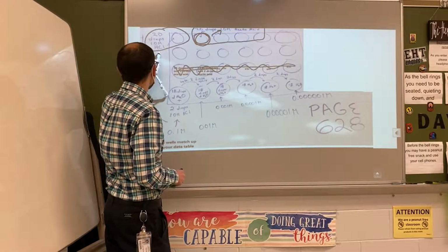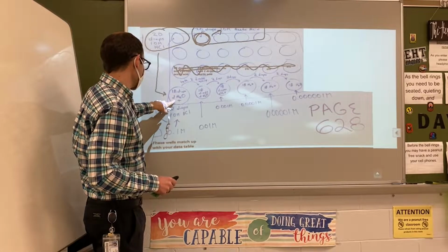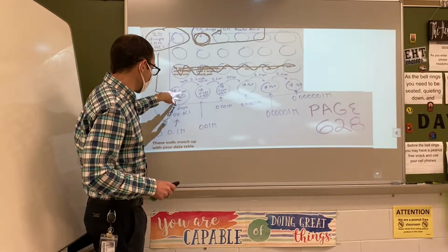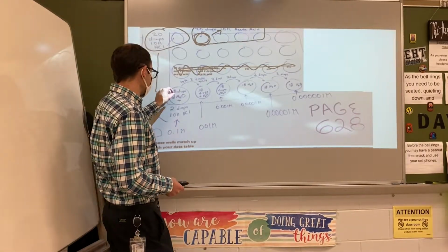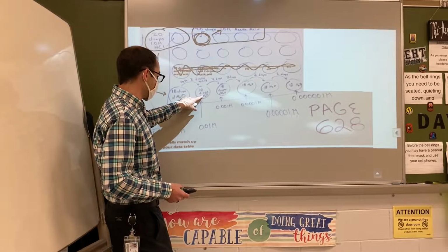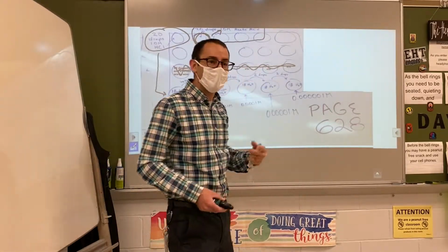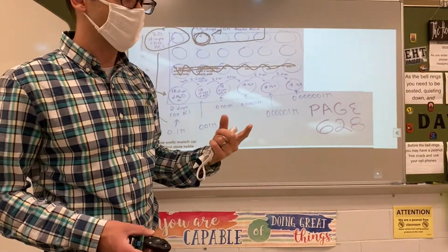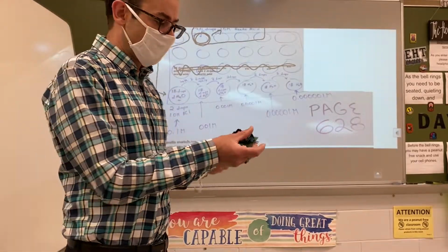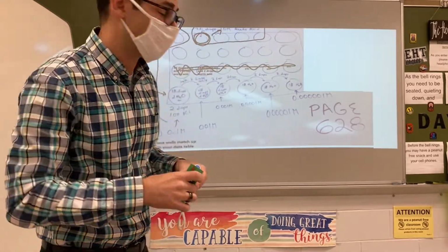So we have our hydrochloric. We're going to take 2 drops of our hydrochloric acid and put it in here. We're going to add 18 drops of distilled water. We'll mix it up just like we did before, all right? And then we use our dropper bottle to take 2 drops from here, 2 drops into here, 18 drops of water, mix it up. Same thing, same thing, same thing, same thing. Last time we did this, we did 9 drops and 1 drop to make 10. We're just doubling it so we have more solution, so that we can make sure that the conductivity meters can actually get in there and fit, so that it lights up, all right?